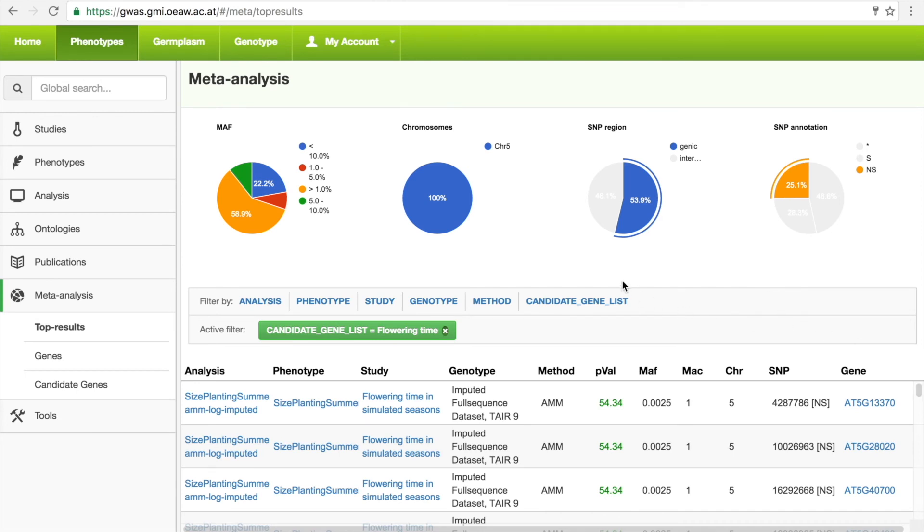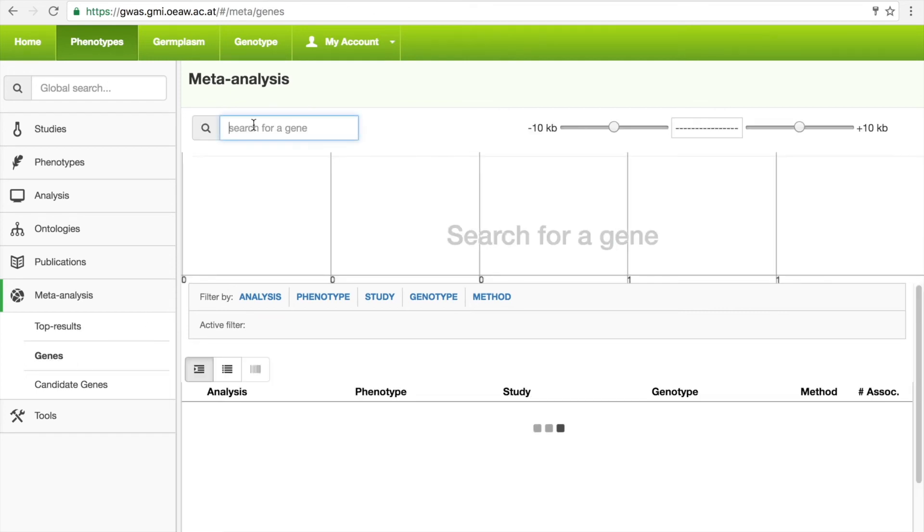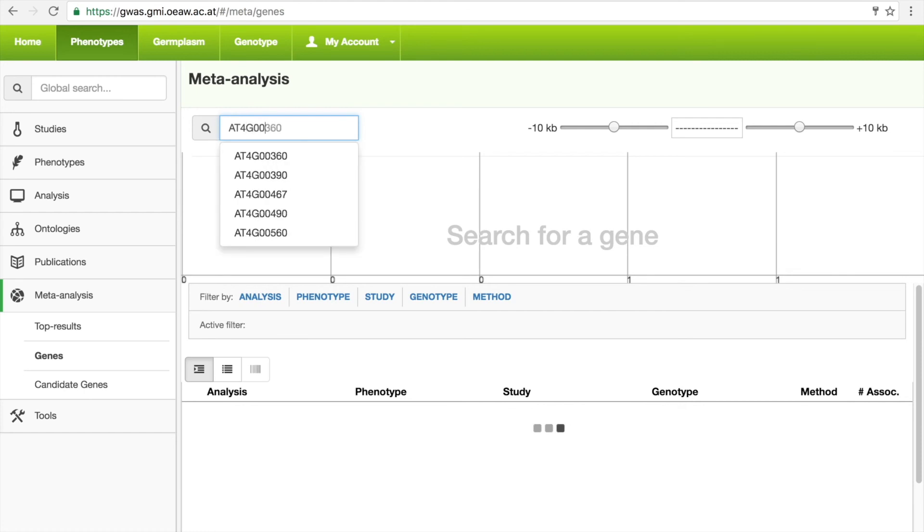Another use case would be if the user is interested in a specific gene and wants to know which phenotypes it is associated with. By navigating to the gene view, the database can be searched with the TAIR gene ID.